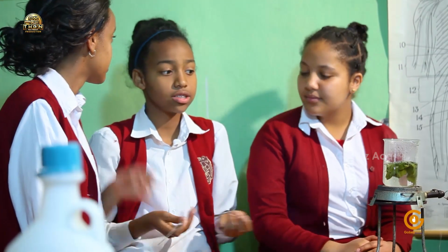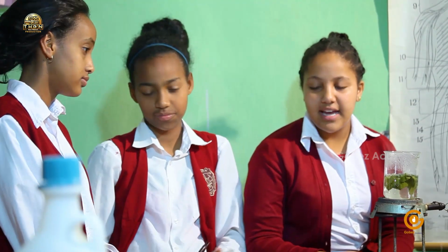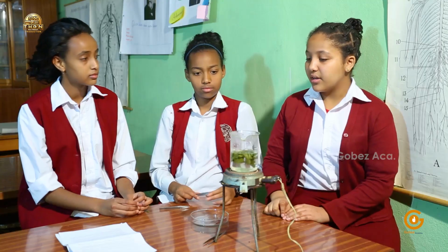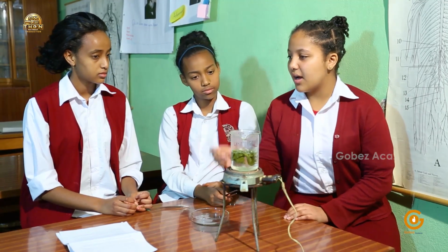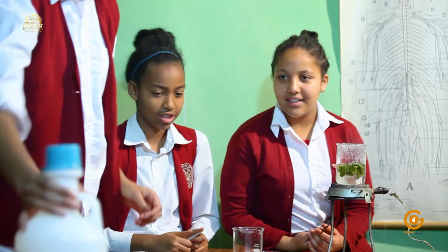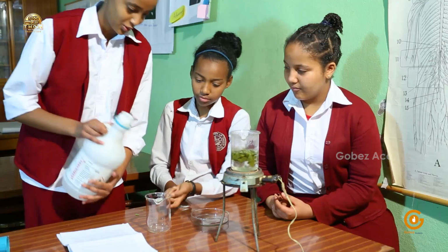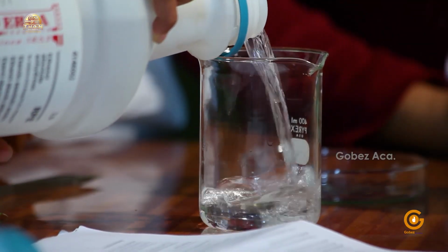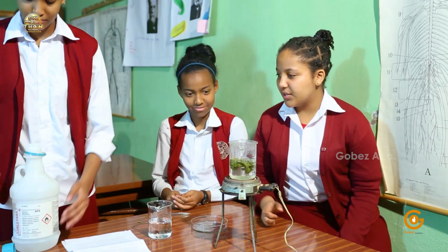Still, it is difficult to see the color change on starch test on the green leaf, isn't it? Yes, you are right. We also have to remove the chlorophyll from the leaf to see if photosynthesis has occurred. To do this, Mahadev, will you please fill the beaker with ethanol? Sure. And please boil it by reducing the heat.